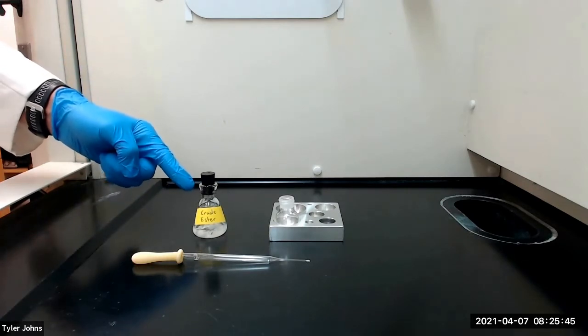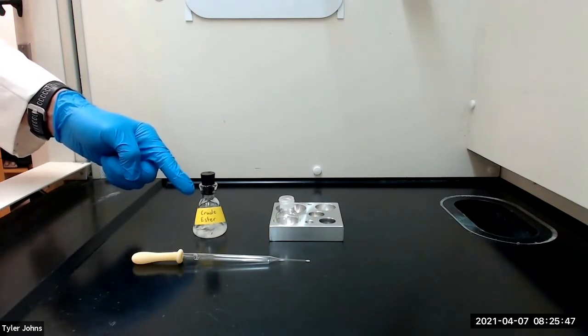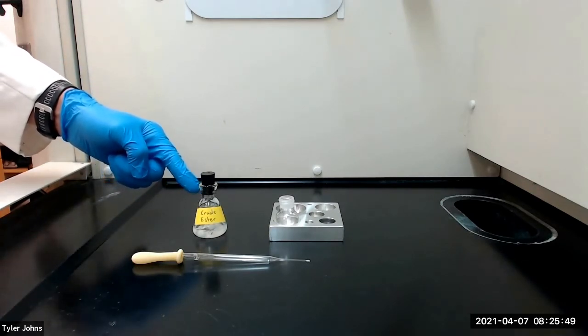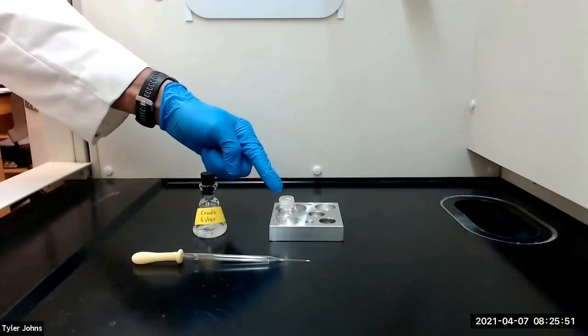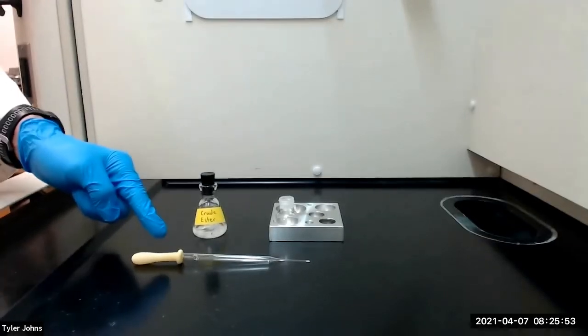After drying the crude ester over anhydrous sodium sulfate, we will next transfer the ester to a 10 milliliter round bottom flask using a filter tip pipette.